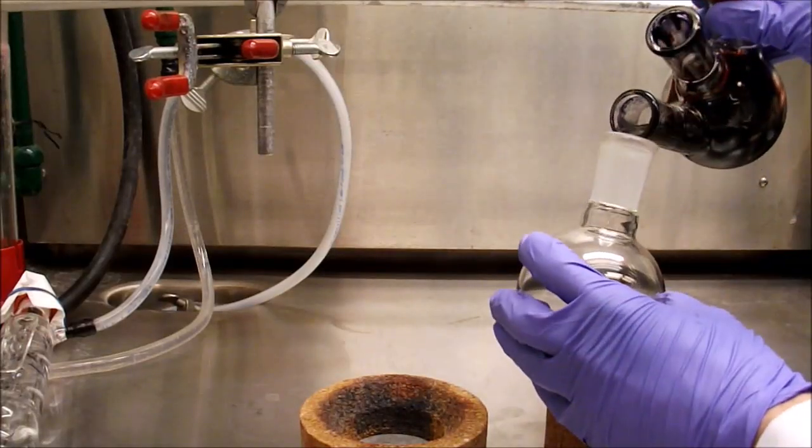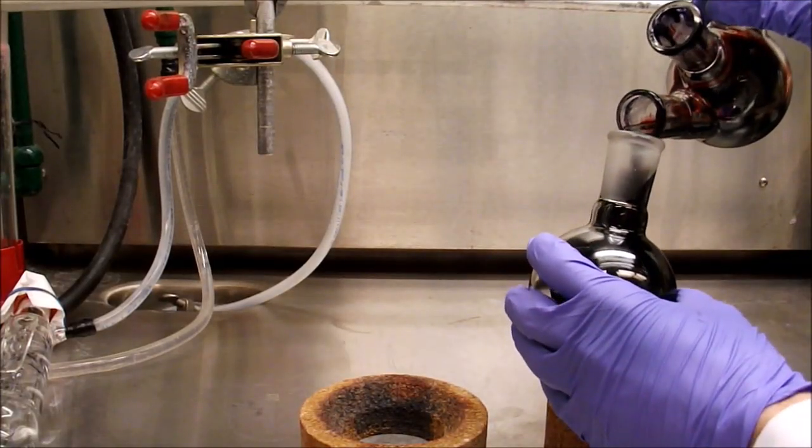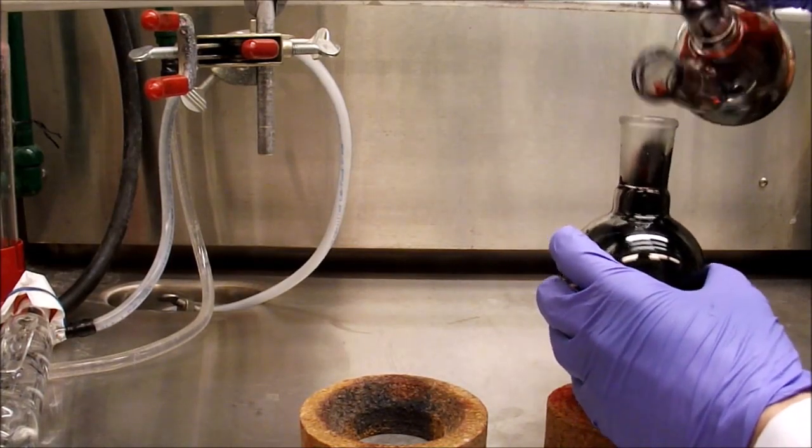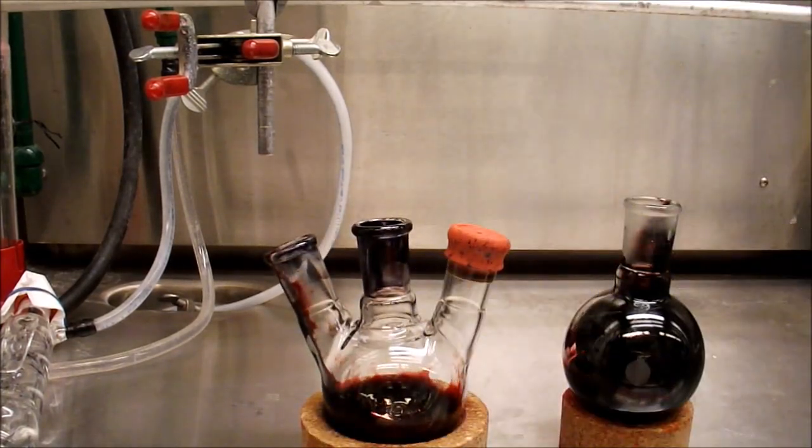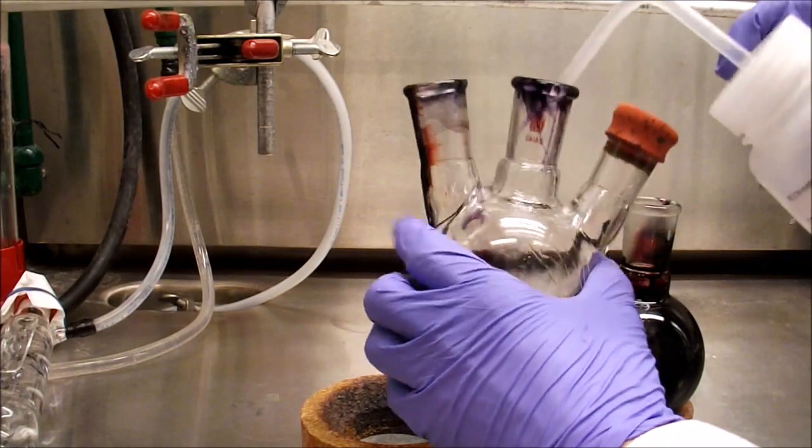The reaction is let to cool to room temperature. After the reaction is cooled, the mixture is transferred to a round bottom flask using a small amount of dichloromethane to transfer and the solvent is removed on a rotavap.